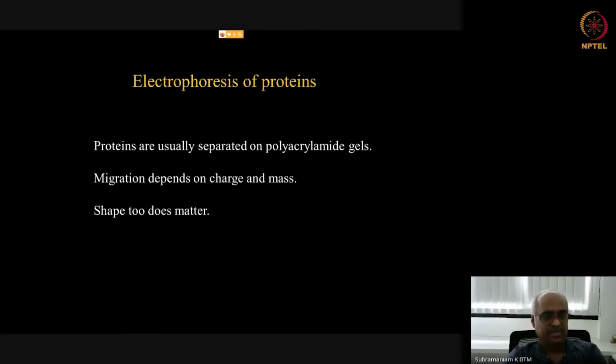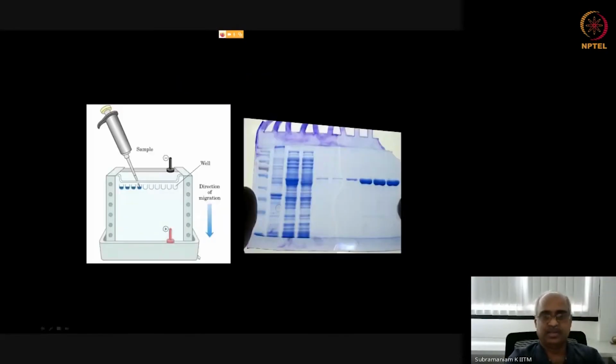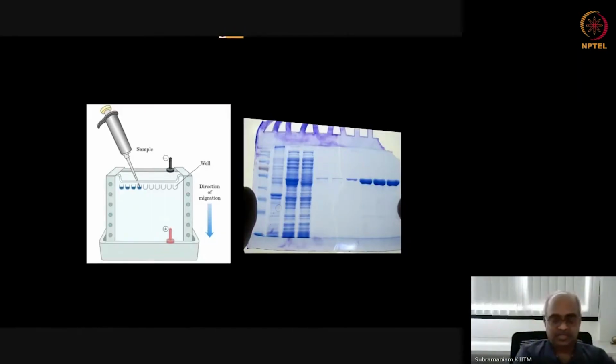And therefore, it is actually the molecular weight. The molecular size of the protein is the sole property based on which proteins are going to be separated in this certain variation of the polyacrylamide gel. So that is what we are going to learn now. Let me take you to the pictures that make it easier to learn. Normally for agarose gel, which is the easiest to make, what we do is we melt. Essentially, you measure out a certain amount of agarose powder.